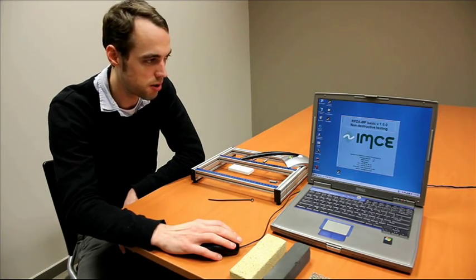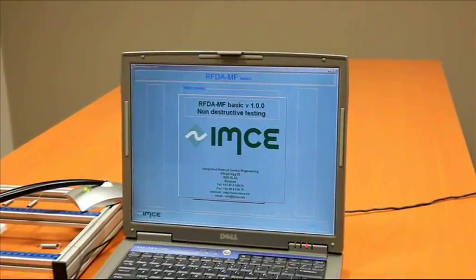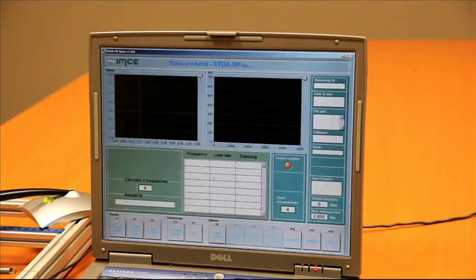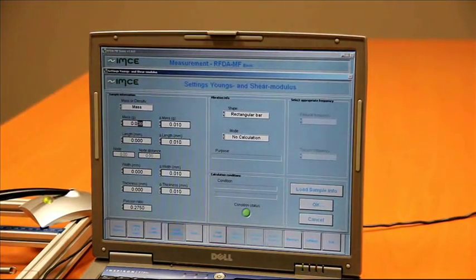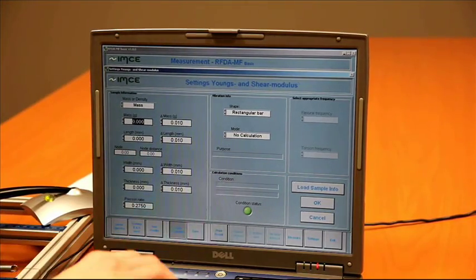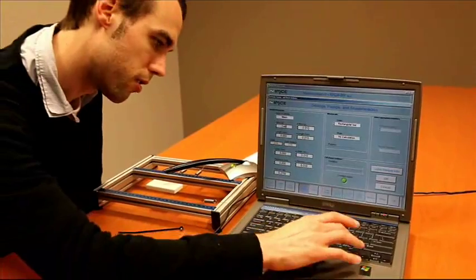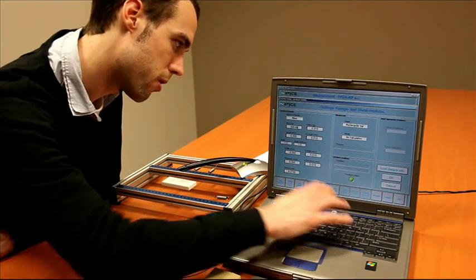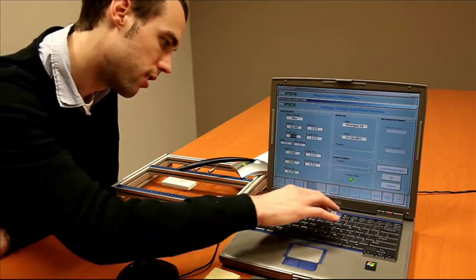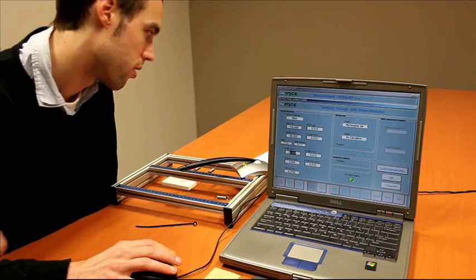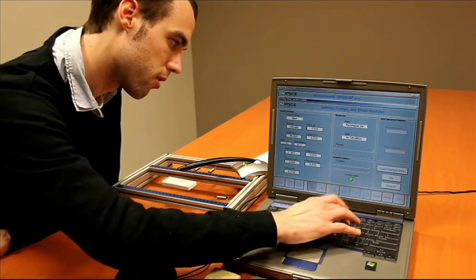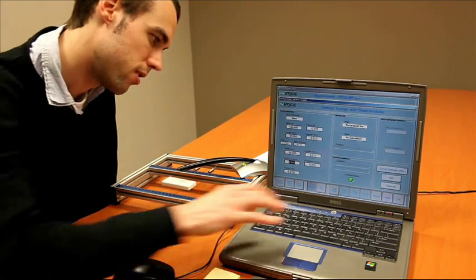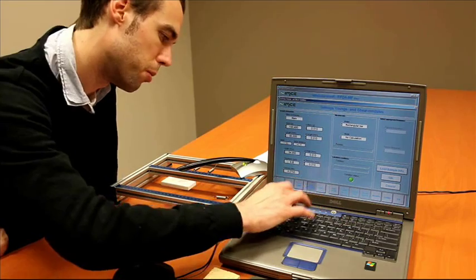The first thing we do is start the RFDA software. We will choose measurement and give in the weight and dimensions of the sample. From this sample, it's 148.48. The length is 80 millimeters, the width is 34.99, and thickness is 8.93 millimeters.